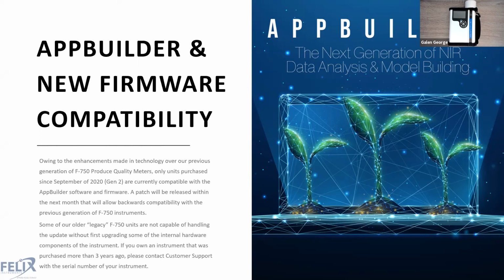And then additionally, if you own a legacy instrument, and we're defining a legacy instrument as something that was purchased more than 3 years ago, then there is a slight possibility that you might need a hardware upgrade in order to be fully compatible with this new firmware and AppBuilder software.